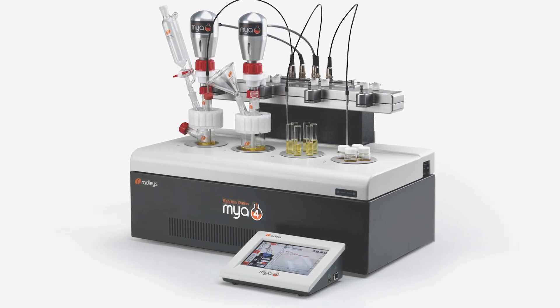We purchased our first one a few years ago and we've used it on a daily basis and haven't looked back. We purchased a second Maya system about a year after the first one, and as we grow, we'll be looking to purchase more to keep up with the pace of the R&D programmes.